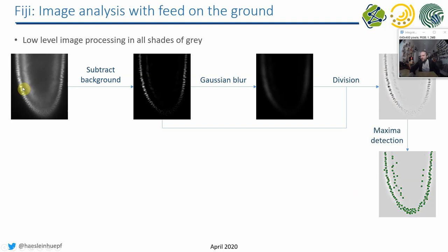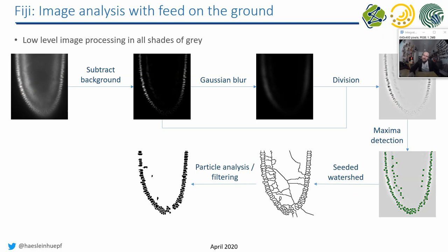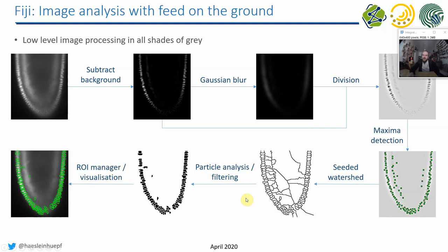You can then do maxima detection to find where objects are actually sitting, apply a so-called seeded watershed, do particle analysis and filtering, and then visualize the regions of interest found in the image on the original dataset. So these are very small processing steps which lead from a raw dataset to an annotated dataset where you can get proper measurements out.